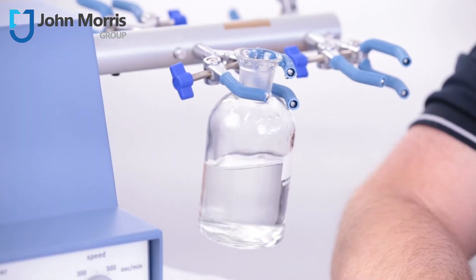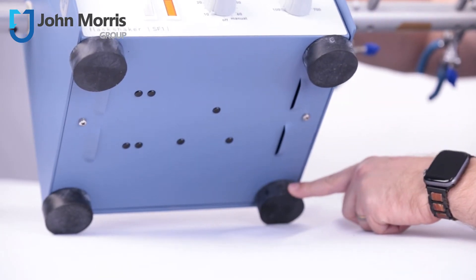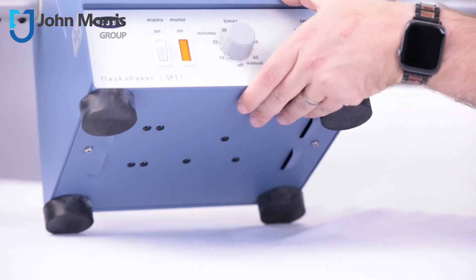To avoid splashing on startup, the SF1 features a soft start feedback controller. This product feels stable thanks to these rubber feet centred around an eight kilogram mass, and it gives you a constant speed irrespective of the loads.